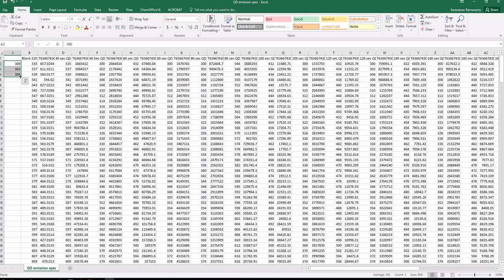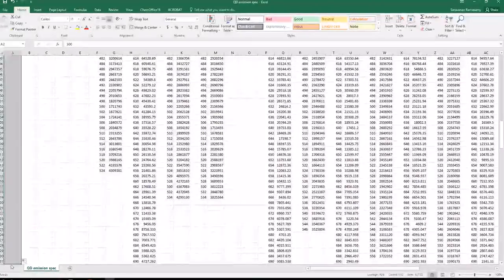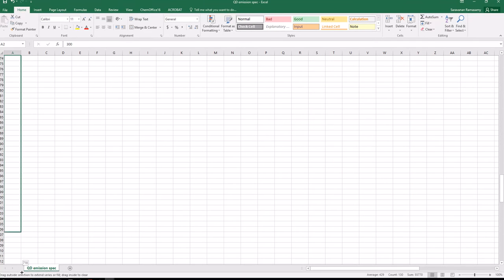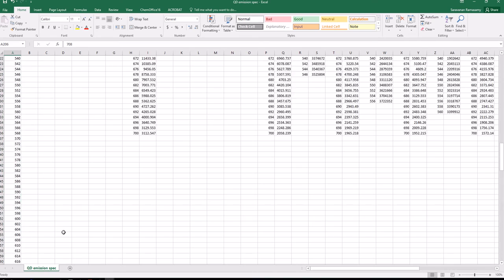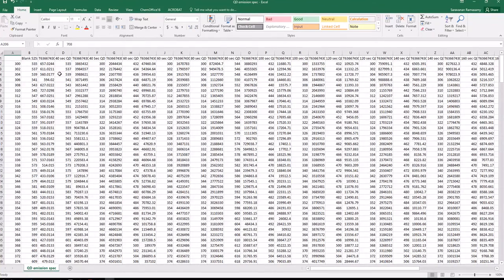I think you can just drag it, and it increases. So let's go all the way to 700. Okay, here's our 700. So 300, 302, 304, 306.